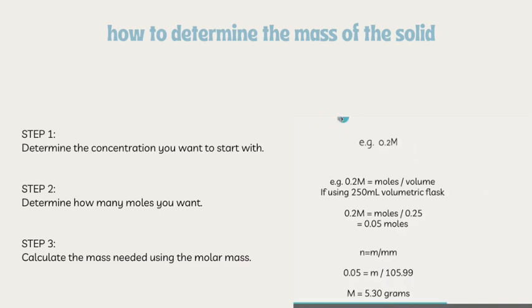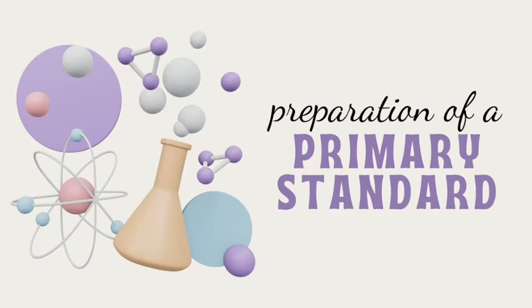In the example I'm showing you next, I'm not going to use that much. That actually is quite a lot. It's quite a lot to dissolve in that amount of water. I'm going to do a much more dilute solution, but I will show you that next.